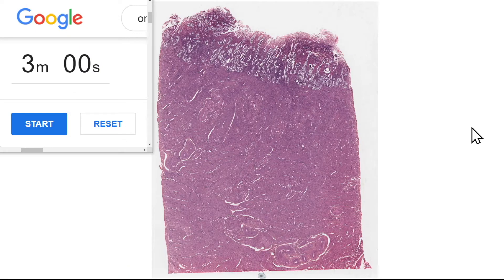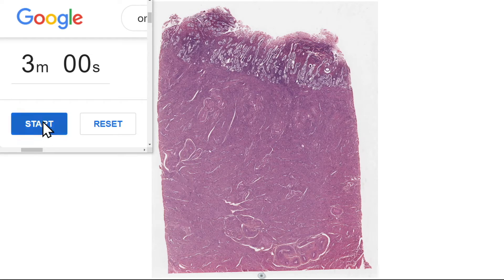G'day everyone, Jamie Chapman for 3 Minute Histology. In this video we're going to be looking at the histology of the uterus, particularly the endometrium of a person undergoing menses or menstruation. So let's start our three minutes.